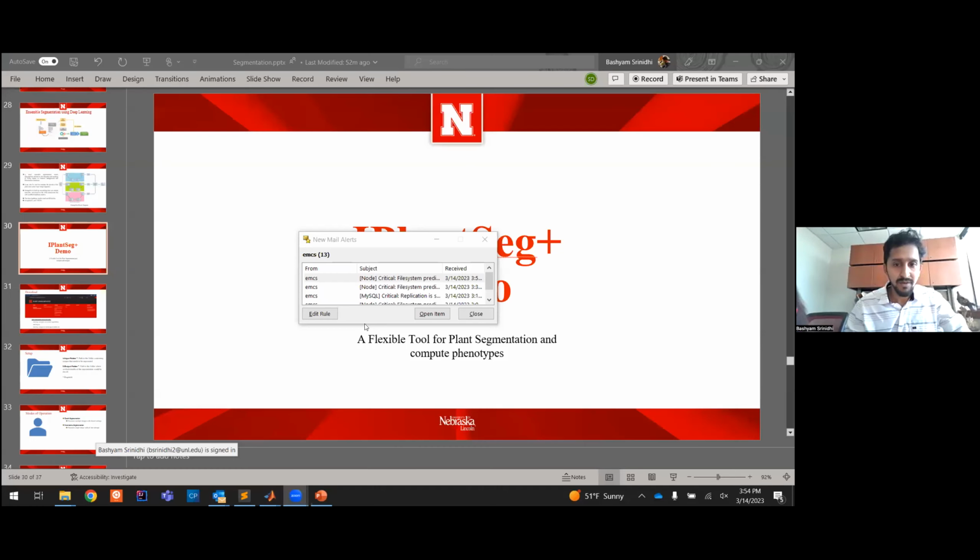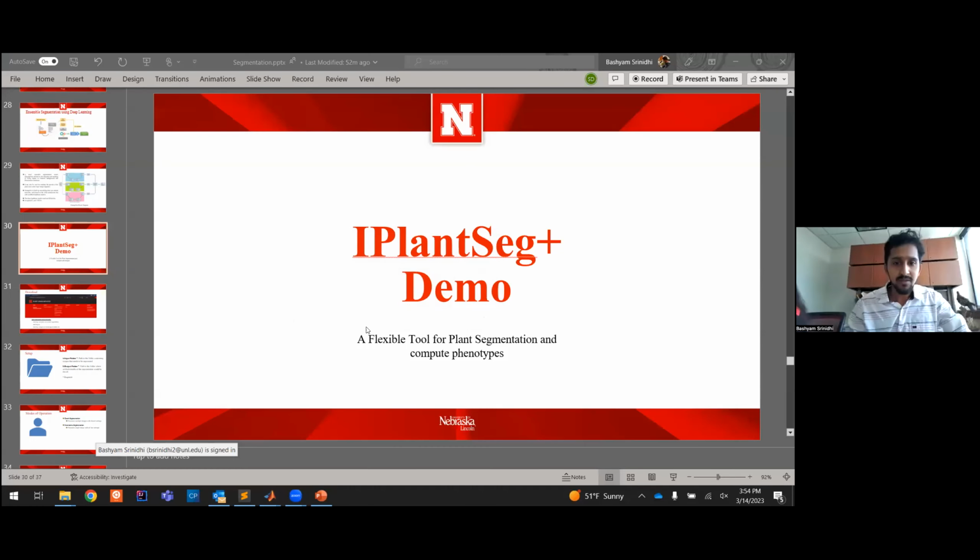Thank you, Shruti, for the detailed explanation on segmentation and its challenges. Let me share my screen before I start on the demo. Okay.